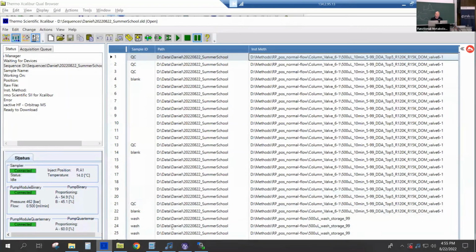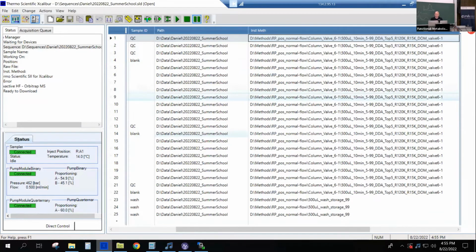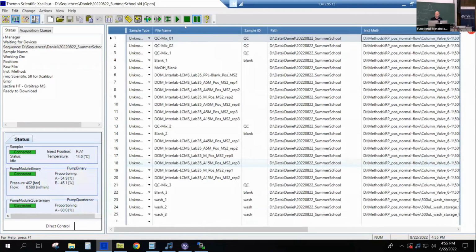Okay, so we have our sequence, and that is basically a little bit what Martin showed you earlier, just that I did it with my very own taste of things. So we don't have a pooled QC here. We run MS on all the samples. I have QC runs before and in between the samples, and then my different samples are run.